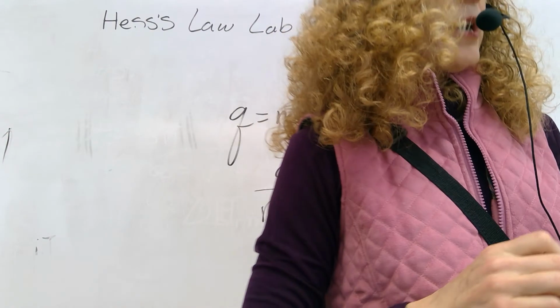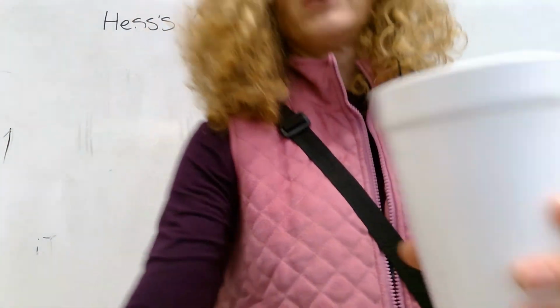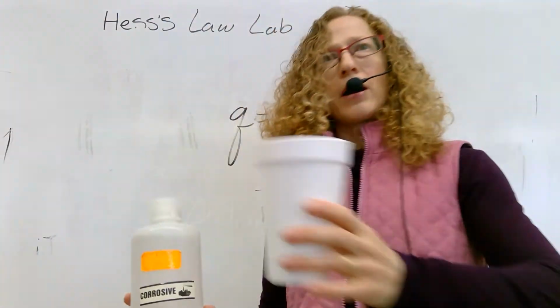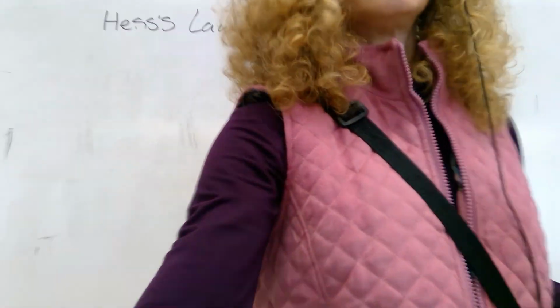Reaction number 3, you're using 2 liquids. So you're going to have 150 milliliters. Don't forget your stir bar. If you want to get the mass of the stir bar alone, you can do it that way. So get the mass of your third dry cup, the stir bar. You're going to add HCl.